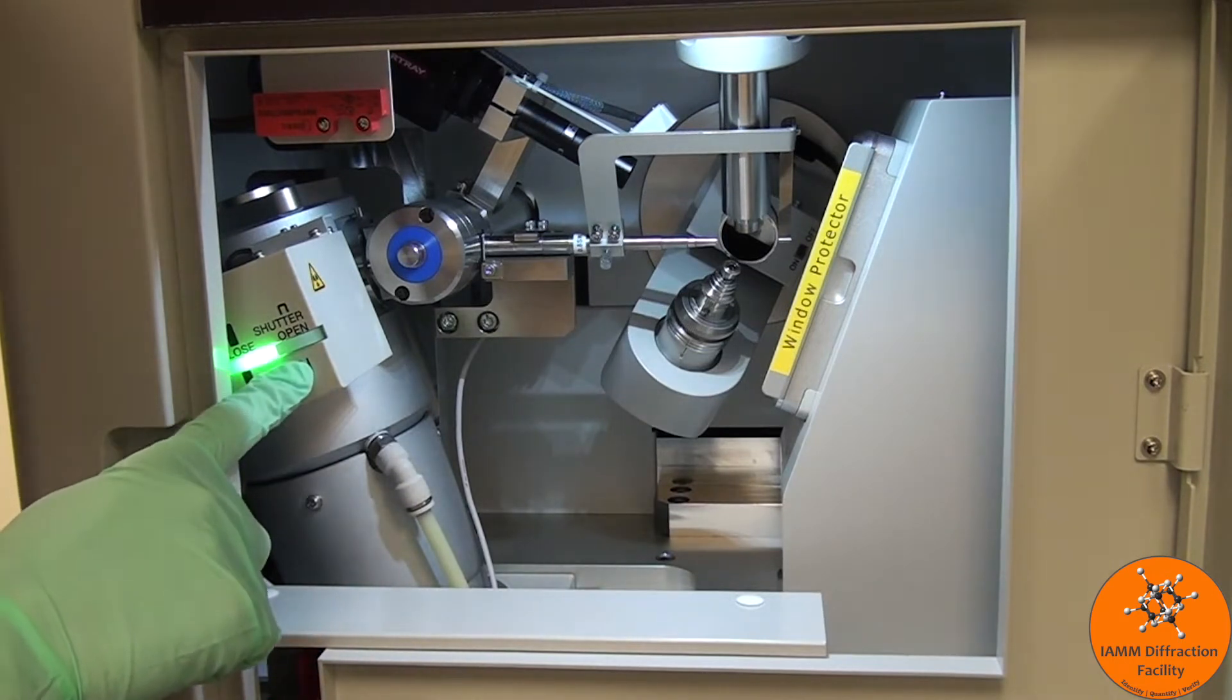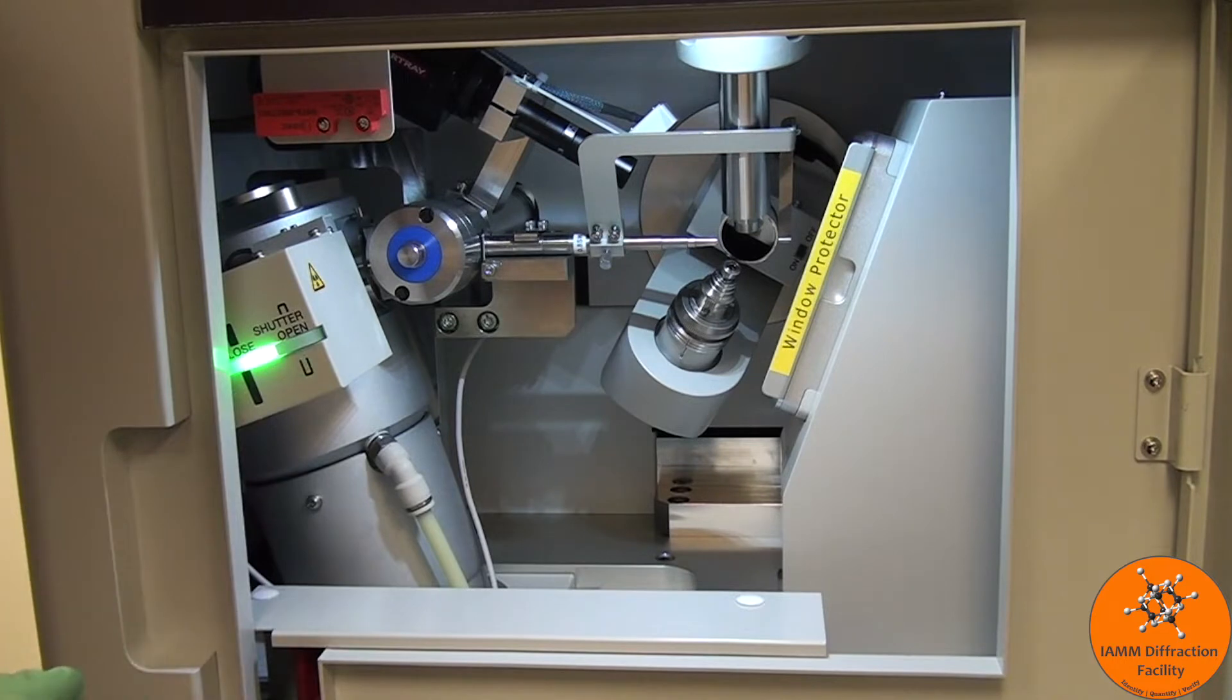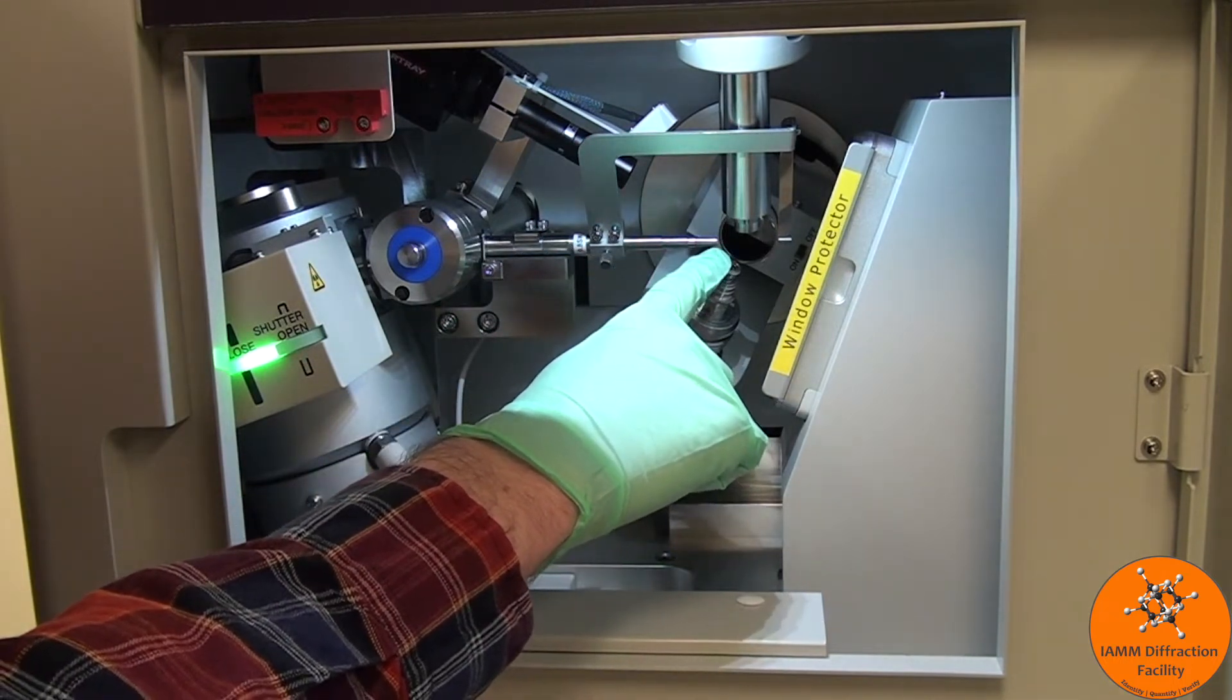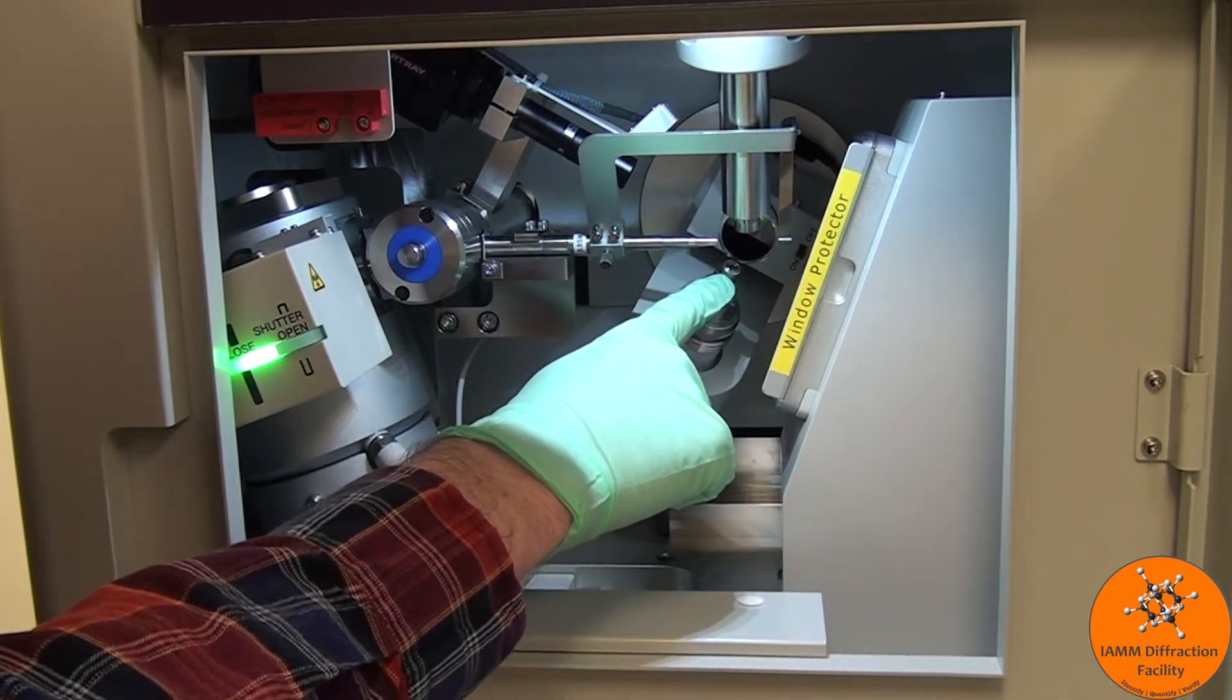We should never be able to see that light though, because in order for that to be turned on, the door would have to be closed and locked. This is the collimator, and this is where the x-rays come out. This is where your sample will sit.